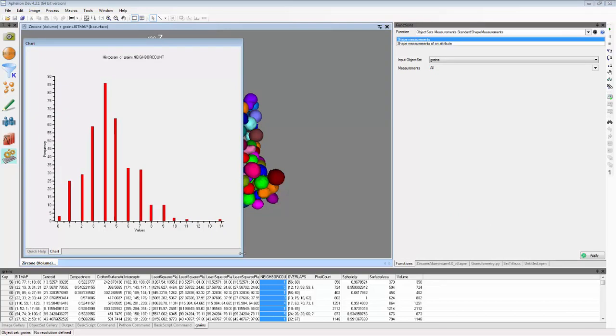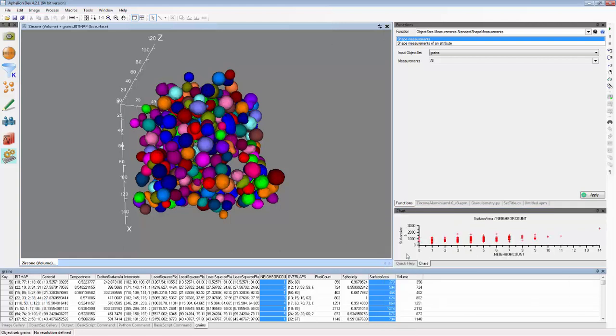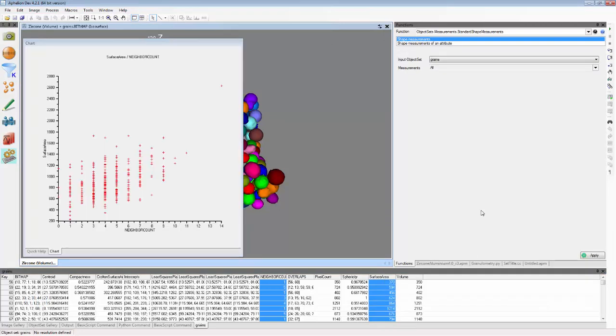Or data can be plotted as a scatter plot of two properties such as number of neighbors versus object surface area by selecting these properties and then selecting scatter plot.